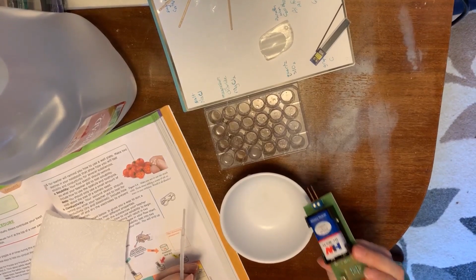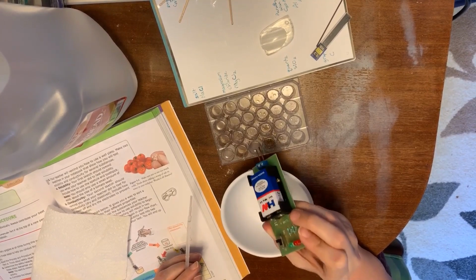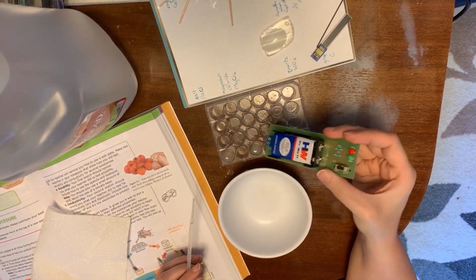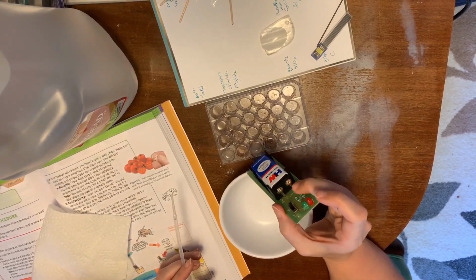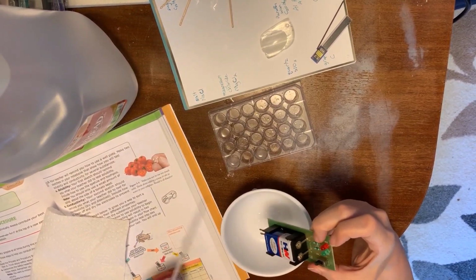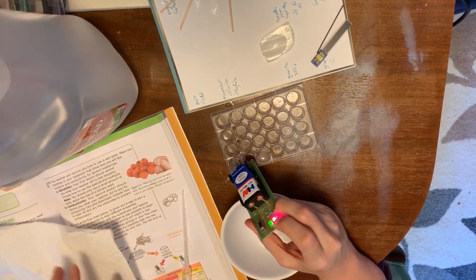All right, so what we need to do is figure out whether or not the substances that dissolved would conduct electricity or not. So we're going to use the conductivity meter just on the substances that dissolved, which are these three. Again, it's the salt, the sugar, and the magnesium chloride. So my conductivity meter is on. So I'm going to stick it in the magnesium chloride, and you can see that the lights light up. And I'm going to rinse it off using some distilled water and wipe it off. Now I'm going to stick it in the salt. And again, you can see that the lights light up.